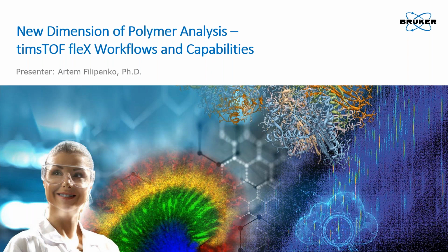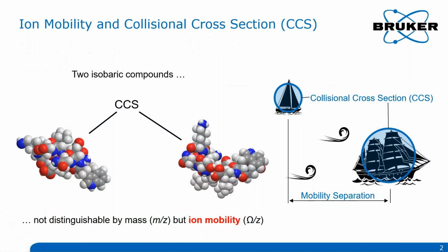Thank you, Nancy. Hello, everybody, and thank you for joining us for this webinar. The topic of today's presentation is New Dimension of Polymer Analysis with timsTOF fleX workflows and new capabilities. Today, we will be talking a lot about ion mobility, or more specifically about trapped ion mobility, and its applications in polymer analysis.